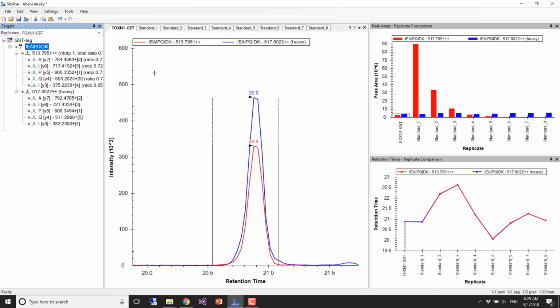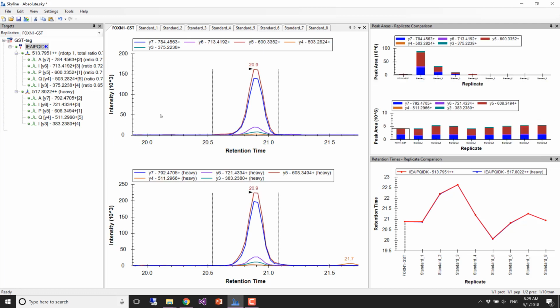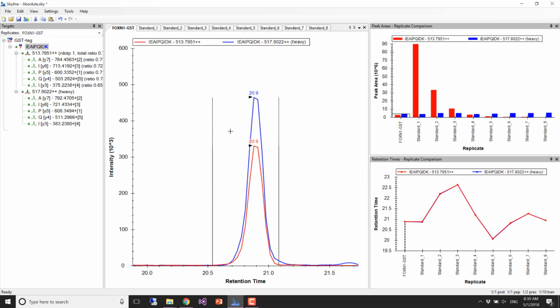this is a useful view for us. I mean, yesterday you learned somebody might be in this mode where there's a transition split graph, where you see everything split up like this. But we're really interested in the relative view, so I'm going to turn that back off, because we're interested in how they look relative to each other. But let's go ahead and just quickly see.